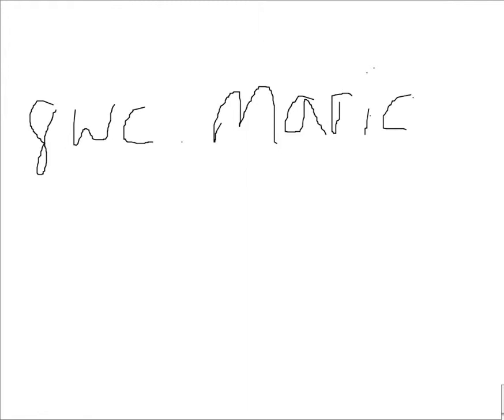Here you can probably just ask yourself, does it look like the quintessential nervous cell that we're used to seeing, being very distinguished? No, okay, great. So we're dealing with some type of connective tissue.